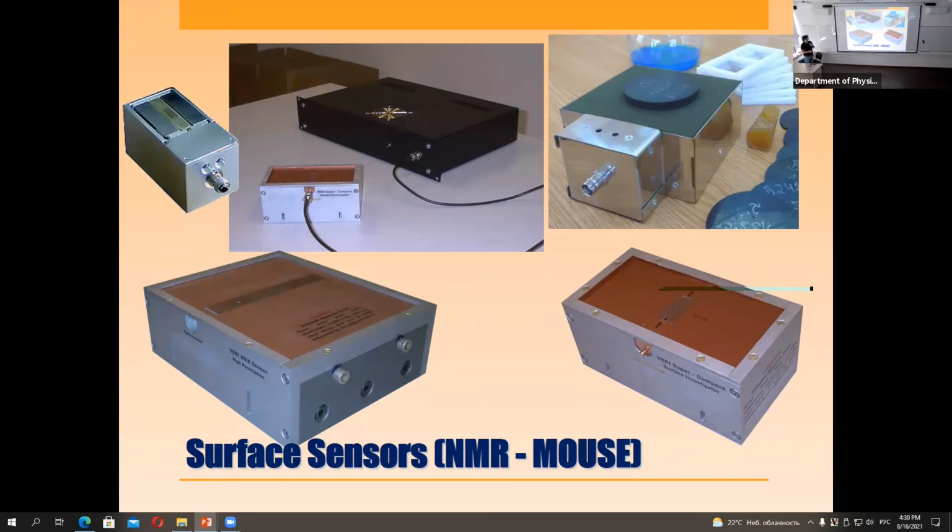If you put something on top, you can measure NMR relaxation. The homogeneity of the device is really poor. Nonetheless, you have the ability to measure NMR. This is actually the cheapest way to build an NMR sensor, NMR probe. And of course, this guy likes to capture all noise and all these radiations. That's why it's very important. If you want to have a precise measurement, you put some kind of copper shielding onto it. So these devices operate from 15 to 25 megahertz.